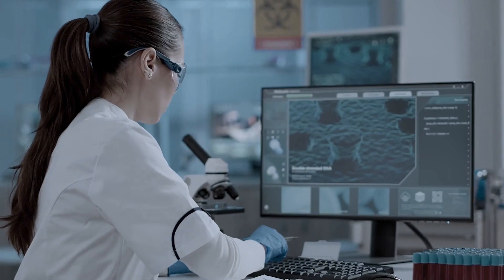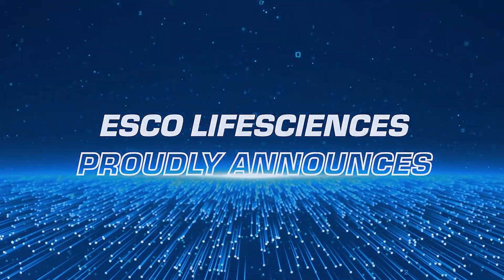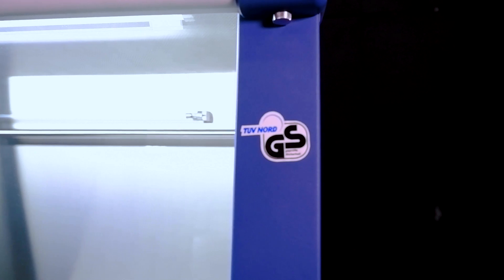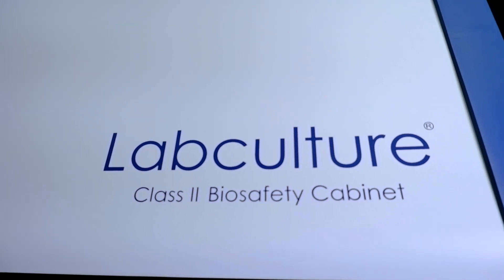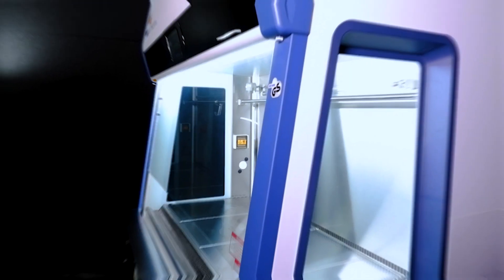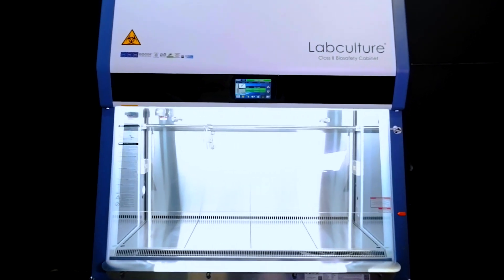Elevating our dedication to pioneering biosafety solutions, ESCO Life Sciences proudly announces the launch of our latest addition to our new products: TUV-NOR certified in accordance with EN 12469, the LabCulture Plus Generation 4 Class 2 Biological Safety Cabinet. Revolutionizing performance and safety, this state-of-the-art biosafety cabinet establishes groundbreaking standards.